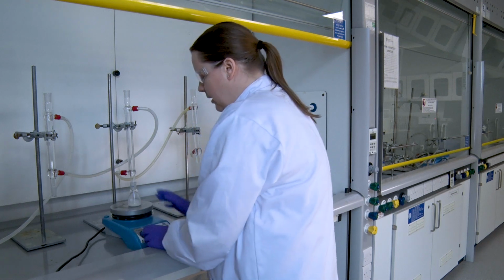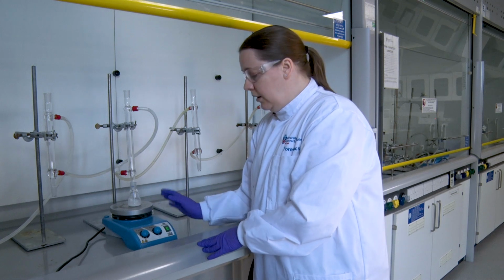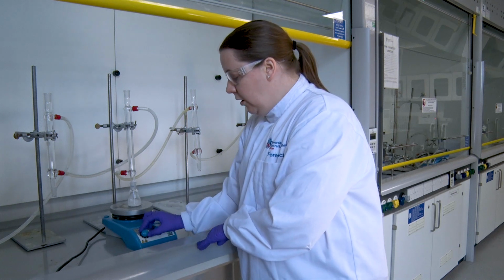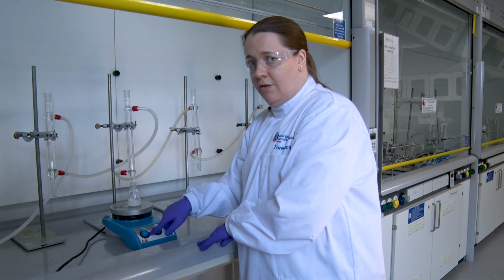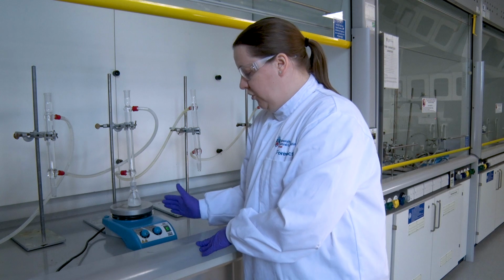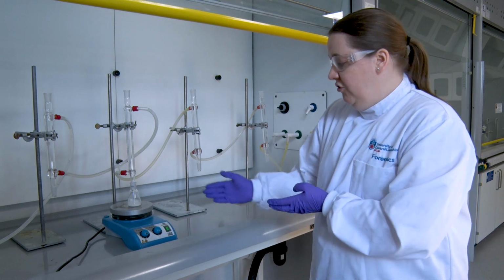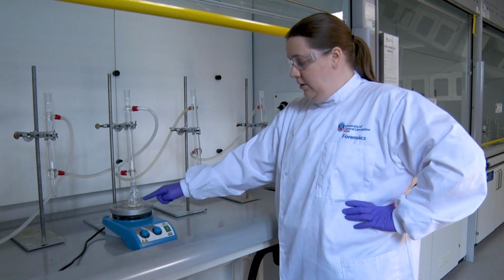So now we're ready to start heating it to reflux. As it's going to reflux, it's going to boil with constant volume. Just turn the hot plate on. The scales are completely arbitrary, so just turn it up. I've got it at about 200, which should be hot enough to start. And then take a step back and just watch it till it starts boiling. You can now see that it's starting to boil.